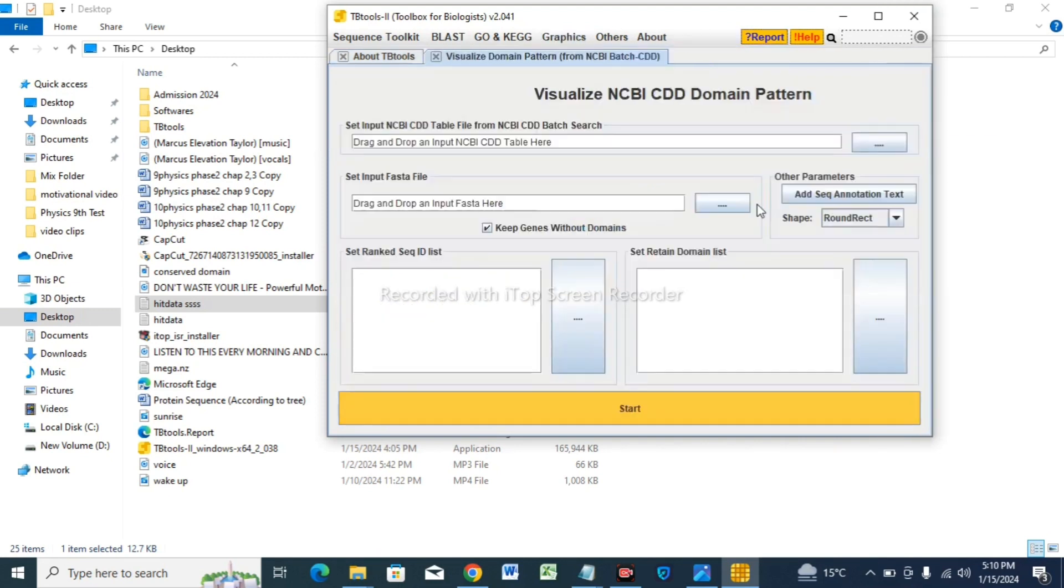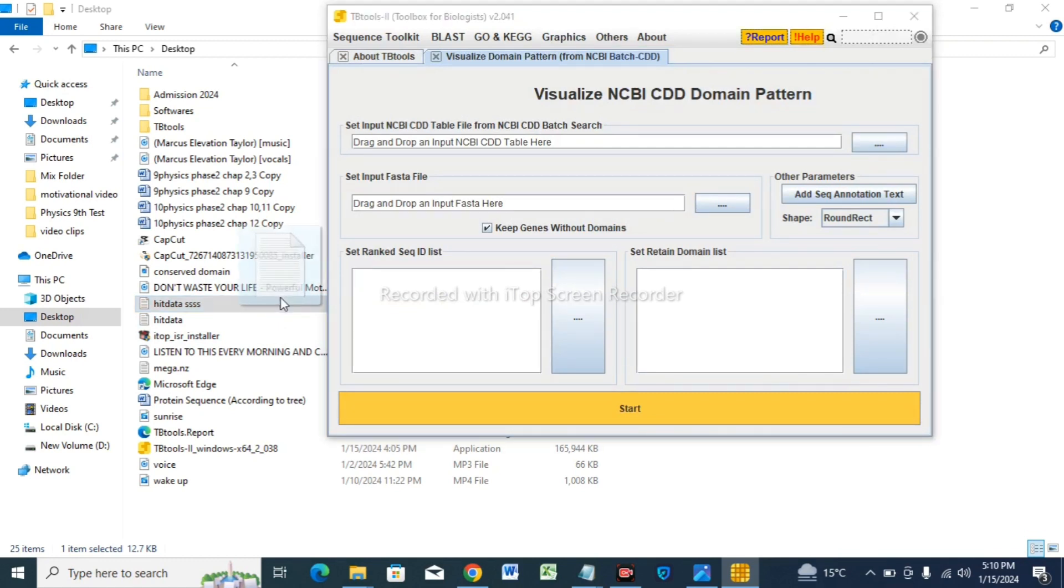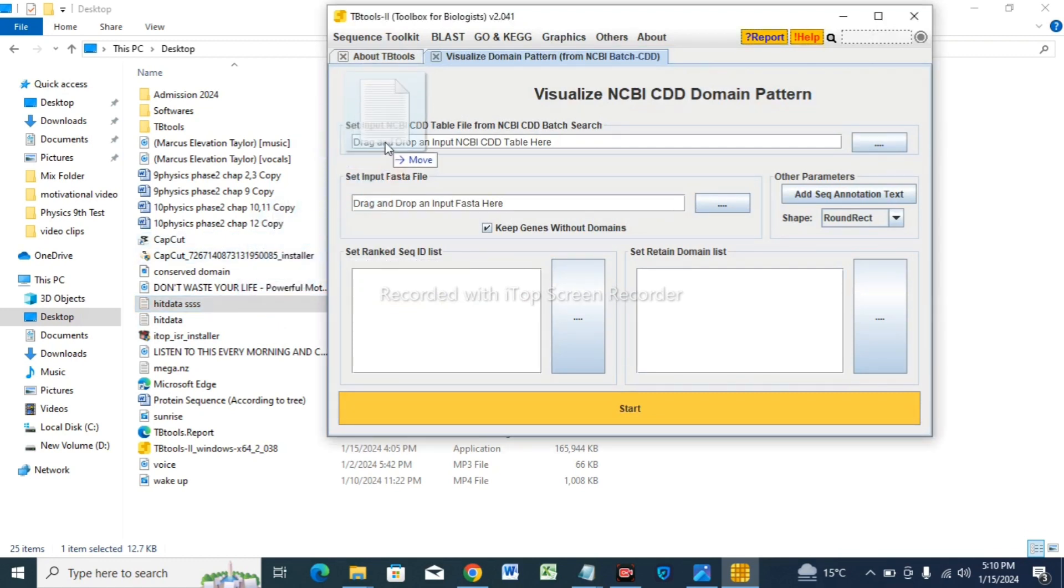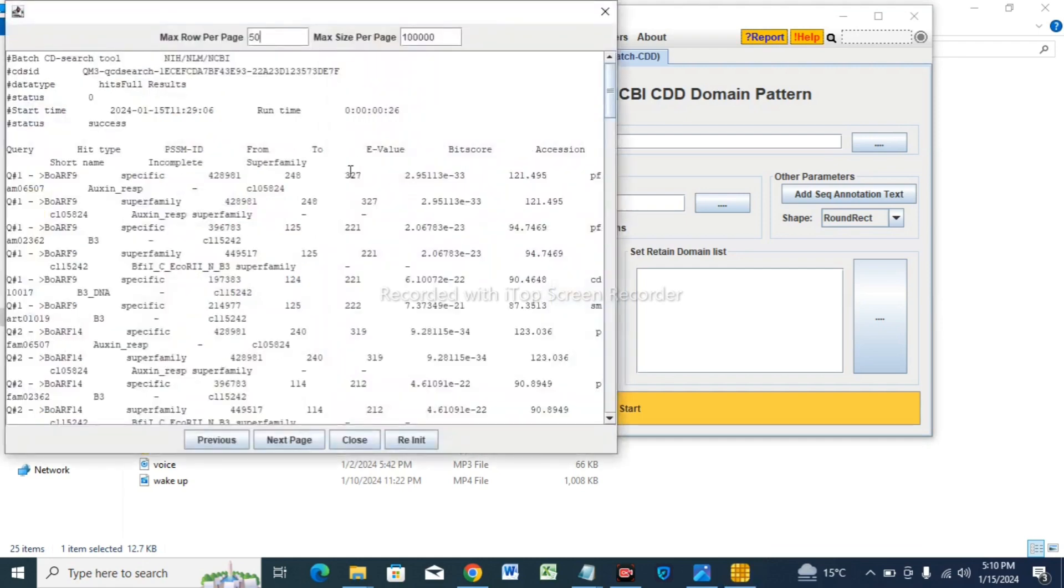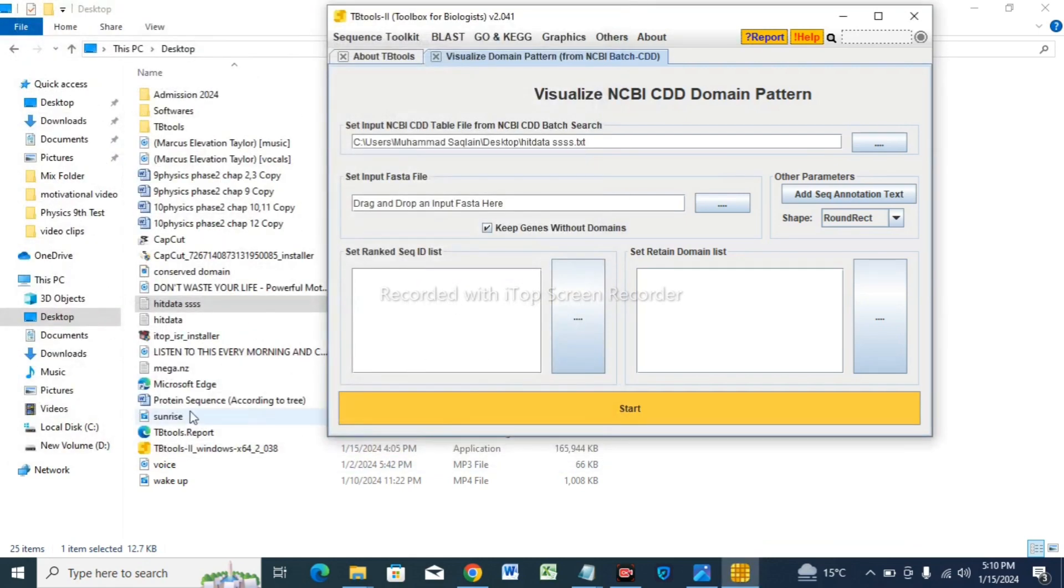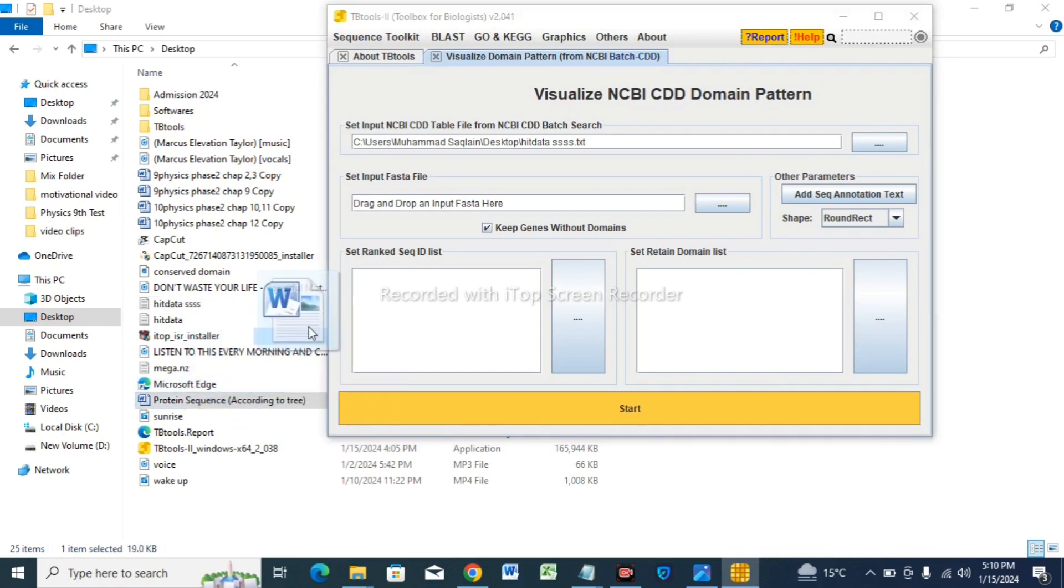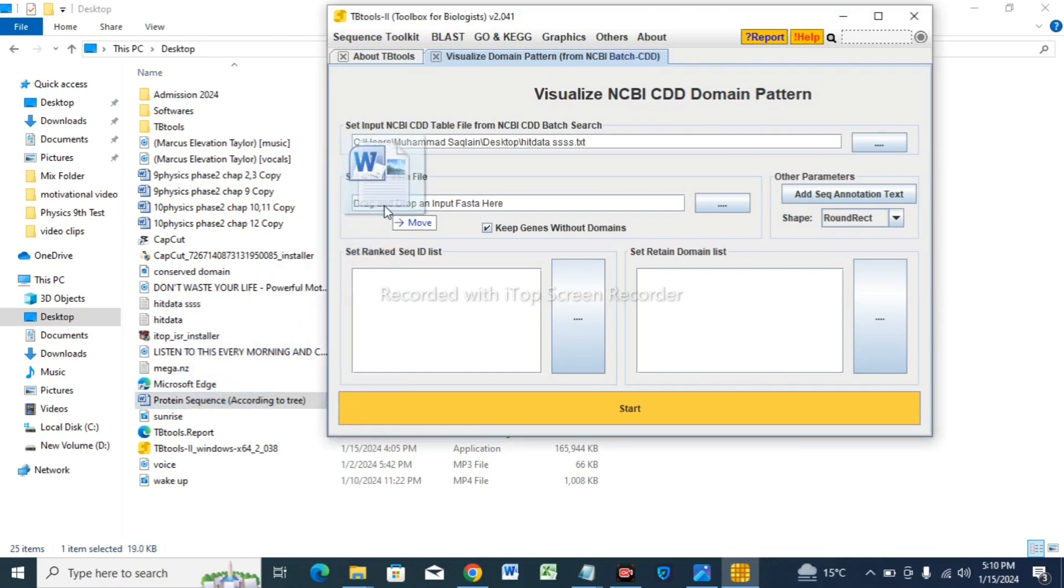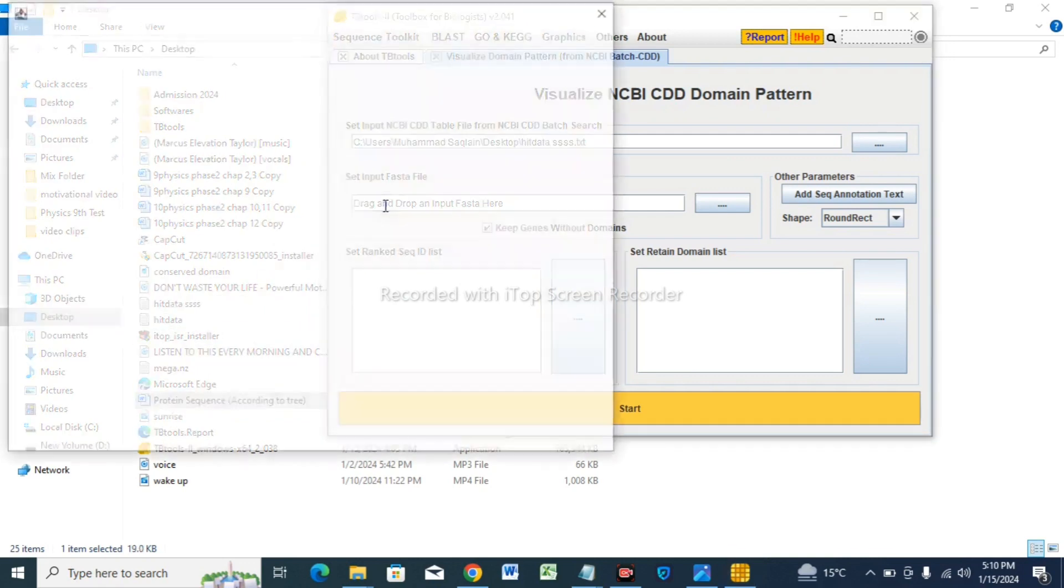Now the heat data file we downloaded, go to the tab and drag these files there. Close. And the protein sequence files that we aligned according to tree, drag them there.